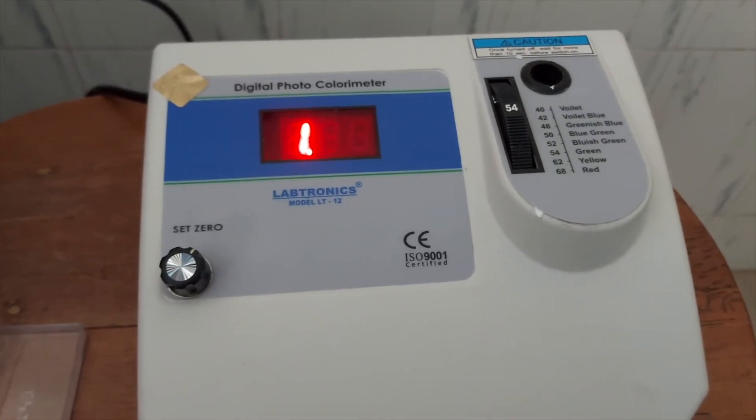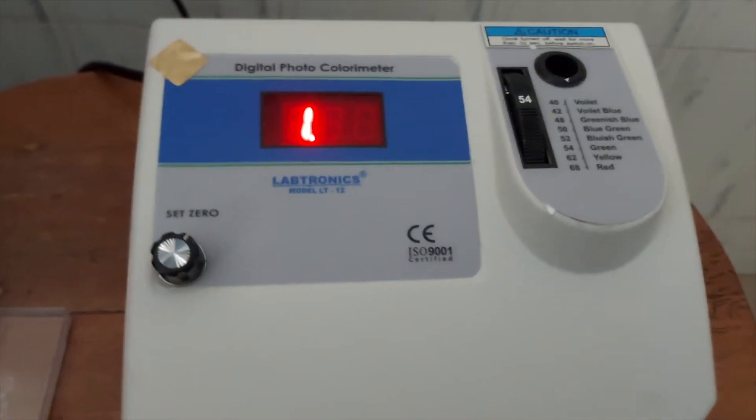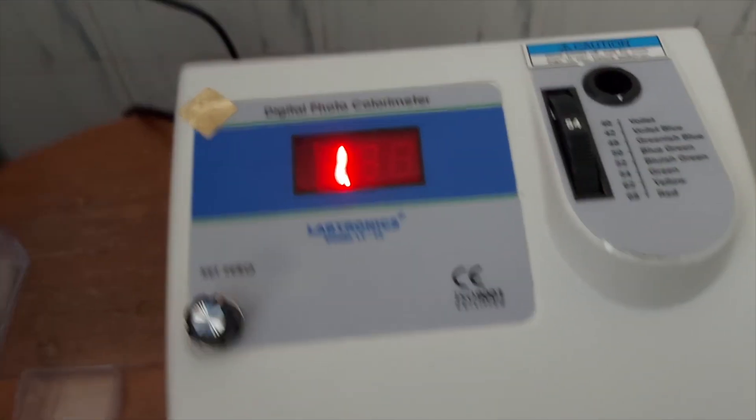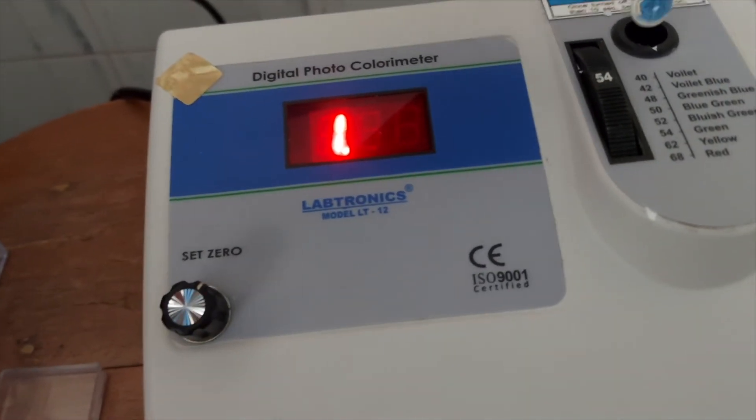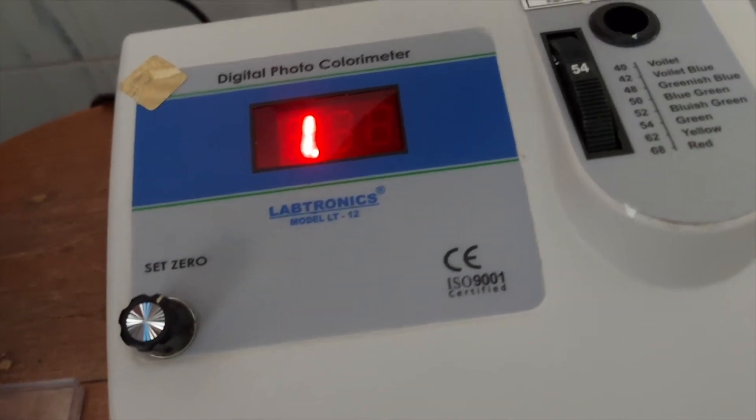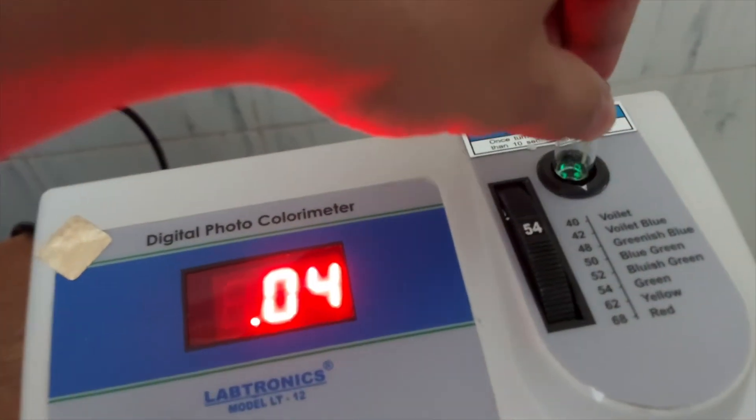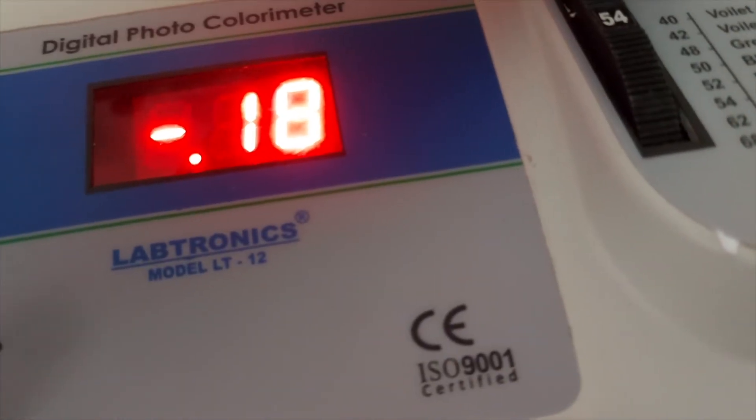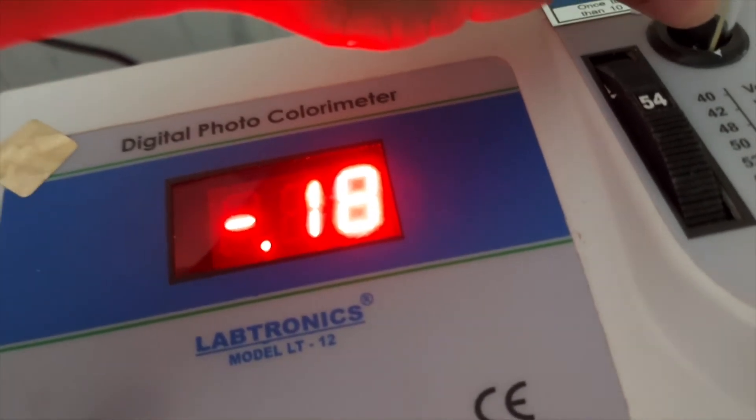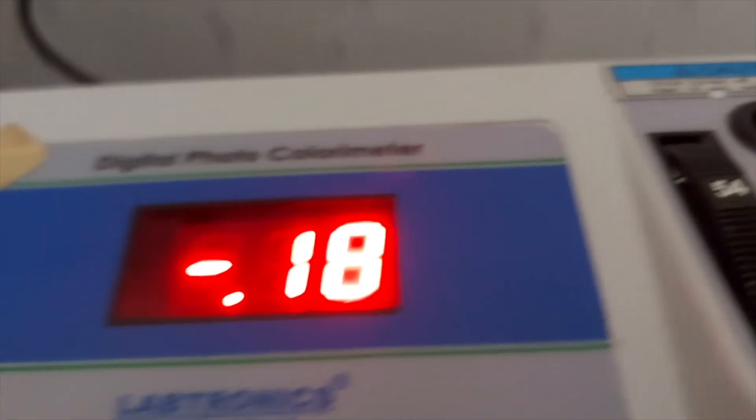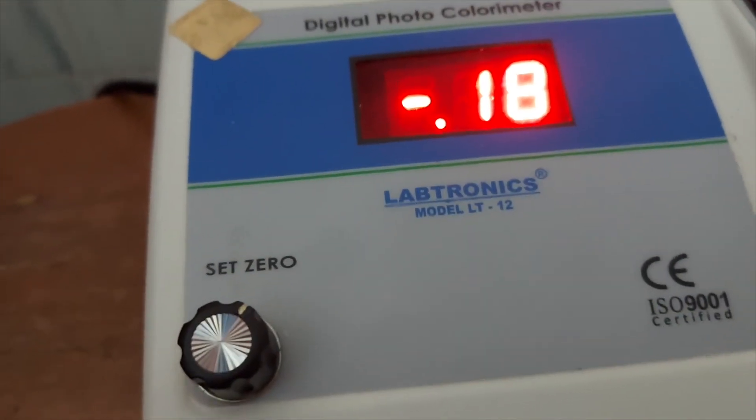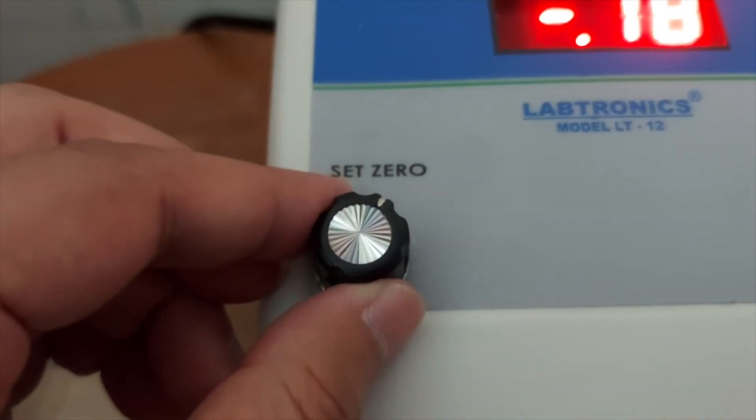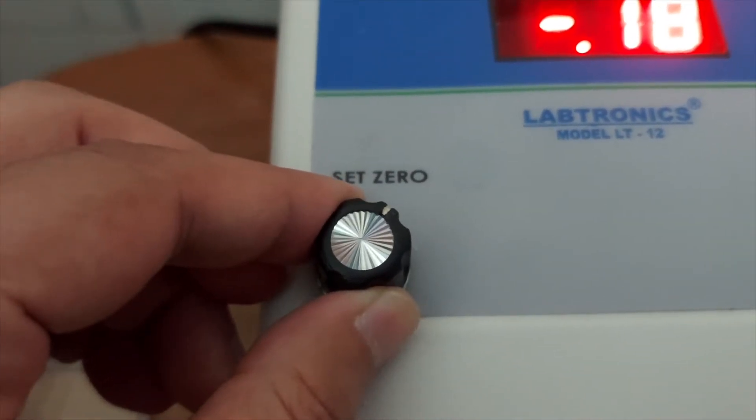So it's already been five minutes since we started the machine. Now we are going to calibrate the machine. For that, we are going to put the distilled water in the housing of the machine, and we have to gently push the cuvette and make sure the two white lines align together. Now we see that the reading is minus 0.18. We have to set it to zero by rotating the knob.